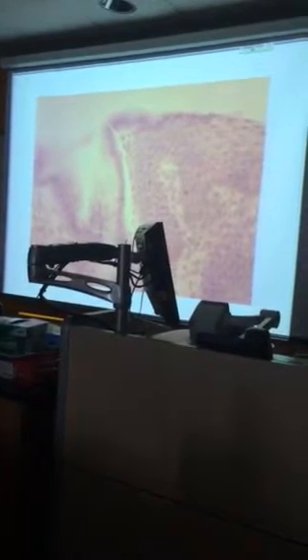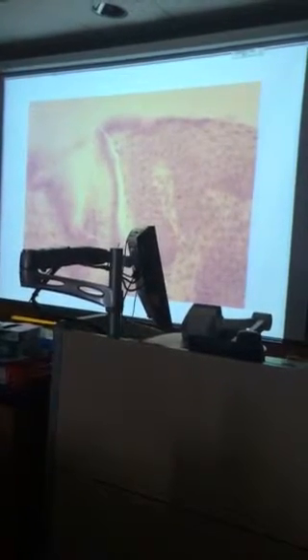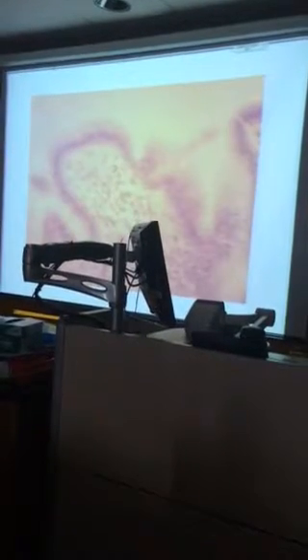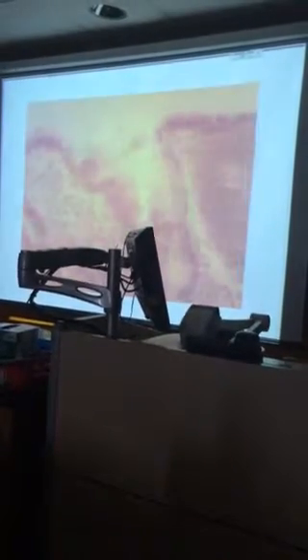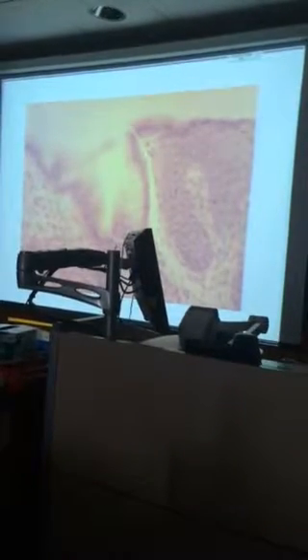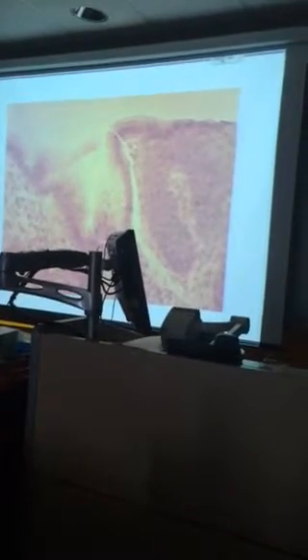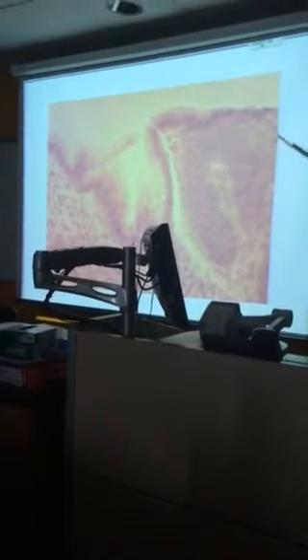Would that represent the gastroesophageal sphincter? Well, no. That's in the vicinity of the esophageal sphincter. That'd be the cardiac sphincter or gastroesophageal sphincter, yes. But it's actually the muscle that is the sphincter, so it'd be deep to this. But the epithelium changes here.